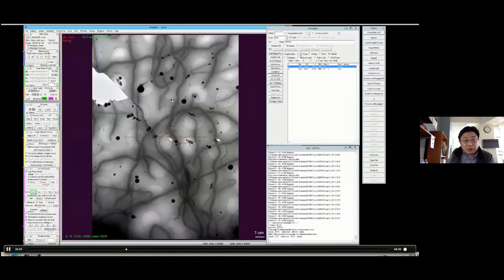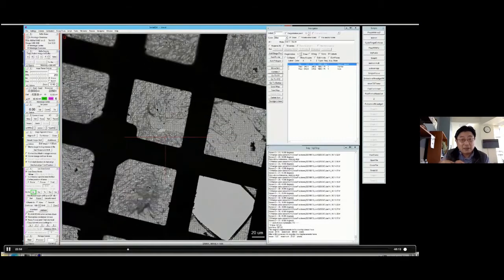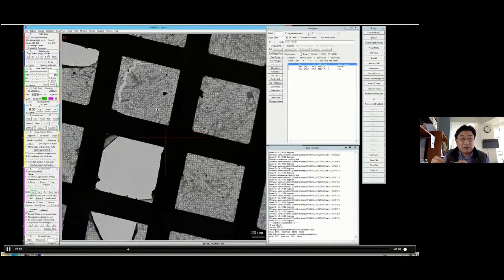Anyway, you see this area is the same as what we labeled. So we want to do this called realign to the marker. So basically align these two objects to the map. So it's about a couple microns off. So now what we see in the tilt series view will be the same as what we see here. Because we now did the alignment, we can start to select and look around for the area targets.